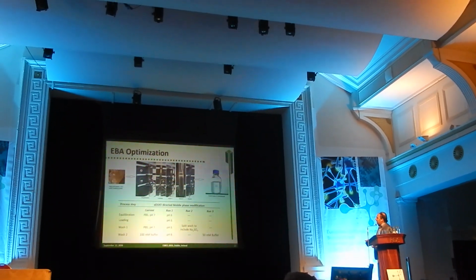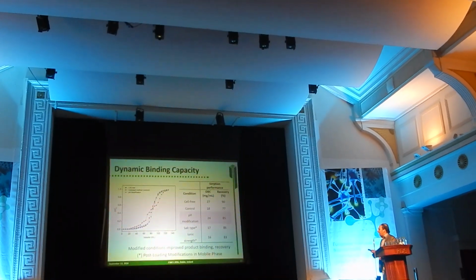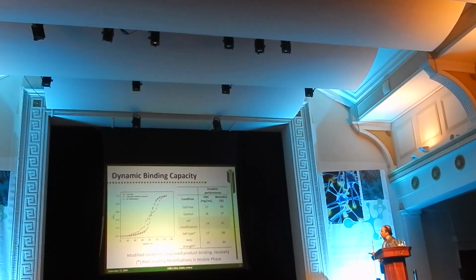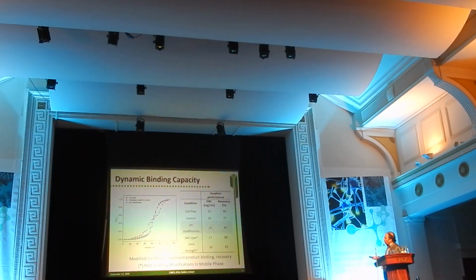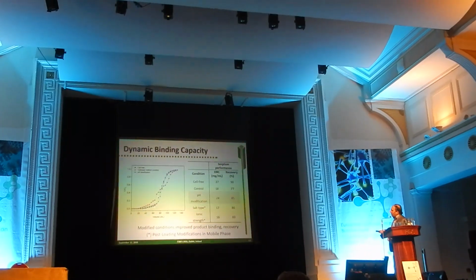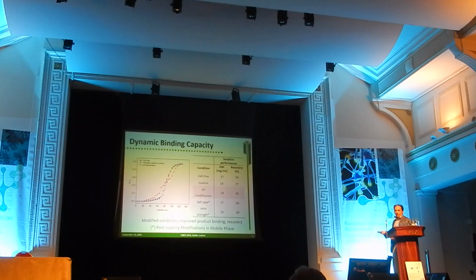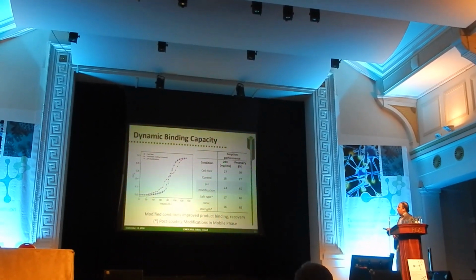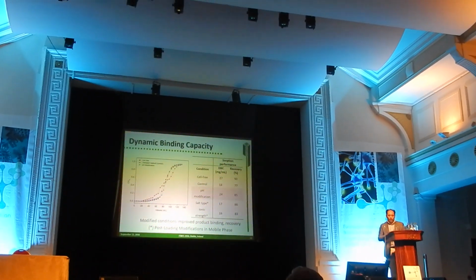And the result of that is that we actually observe, for example, that modification of pH helps you to trap more products, so the red line is the current protocol, and the blue and the black ones here are basically the improved protocol in comparison with cell-free feedstock. So we basically shift from the red situation to the blue situation here. There is already an improvement at the level of the capture of the product.